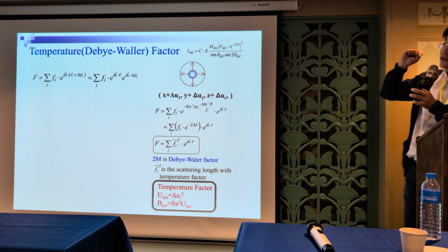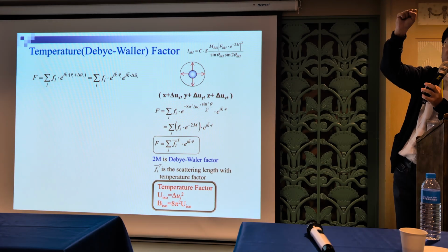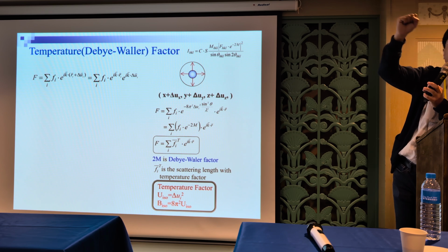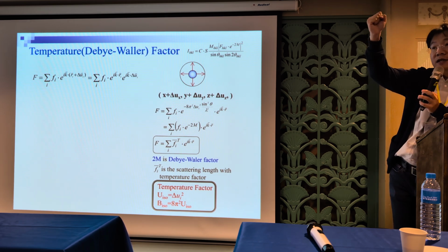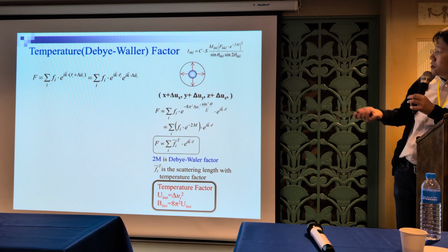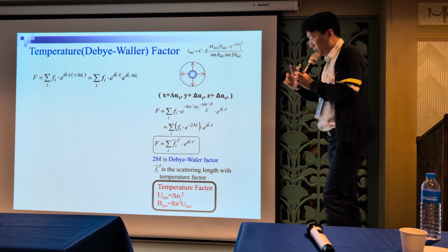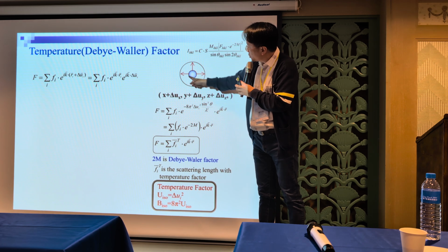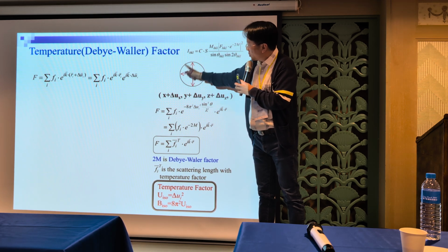So you can imagine that if the X-ray or neutron shines on these atoms, they will sometimes be missed, right? Or they would be hit at some point off its origin. So they give you an equivalent cross section like this one. Okay, this is the original size of the atoms, but this is the effective cross section.